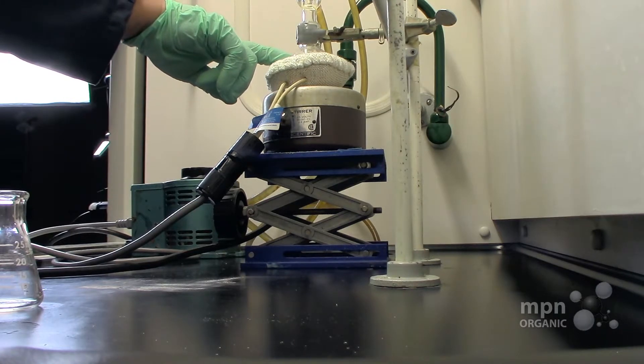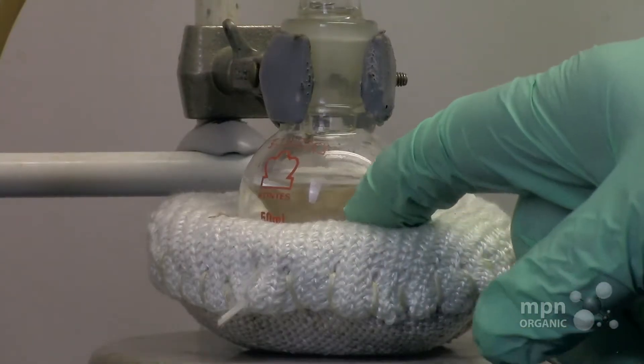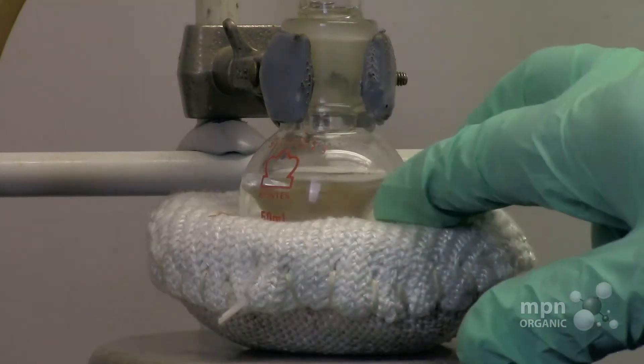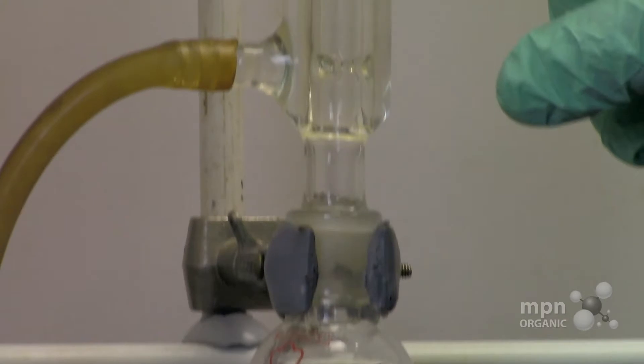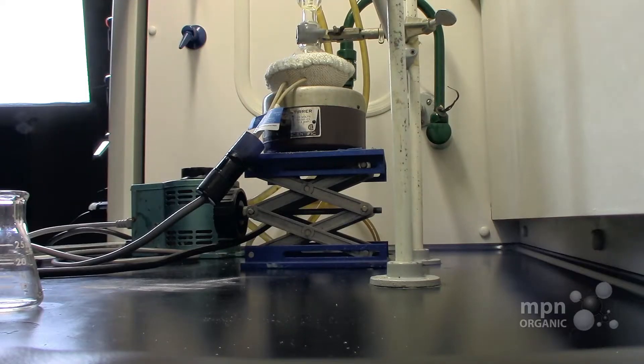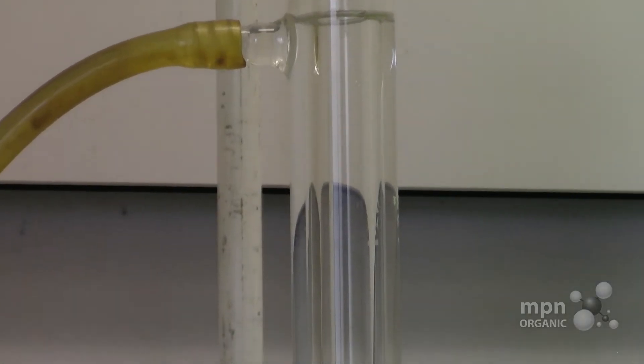It's important to understand why you do this. If you're using a pure solvent like acetone to run a reaction — acetone has a boiling point of about 56 degrees — you set the variac so that it boils. When it boils, it vaporizes up into the condenser. The condenser is cooler than the liquid below, so it condenses and flows back down, providing a constant temperature of about 56 degrees.